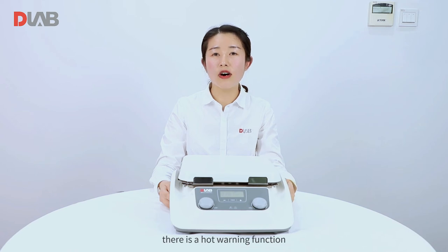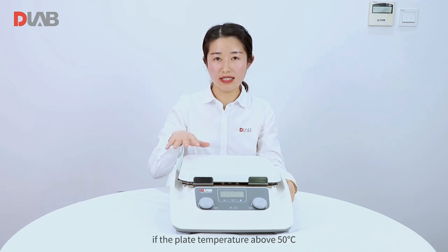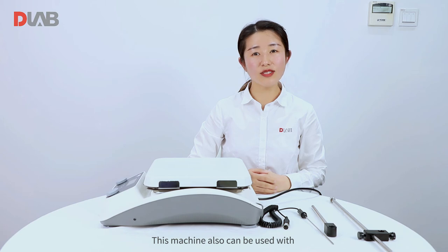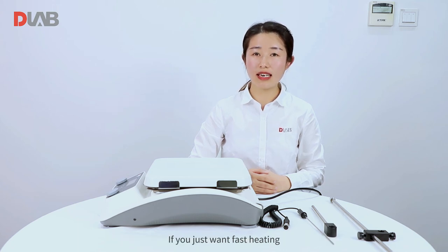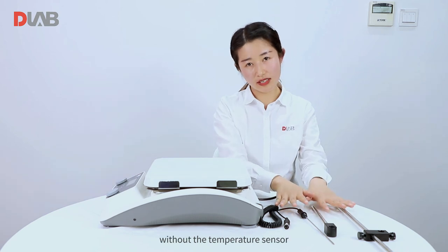By the way, there is a hot warning function. If the plate temperature is above 50 Celsius, a hot warning blinks here. This machine can also be used with a PT1000 temperature sensor for accurate control of the sample. If you just want fast heating, then you can use the machine without the temperature sensor.